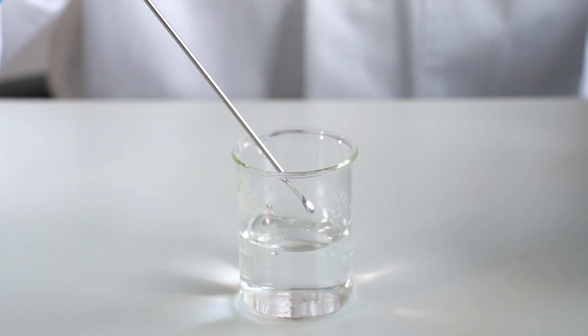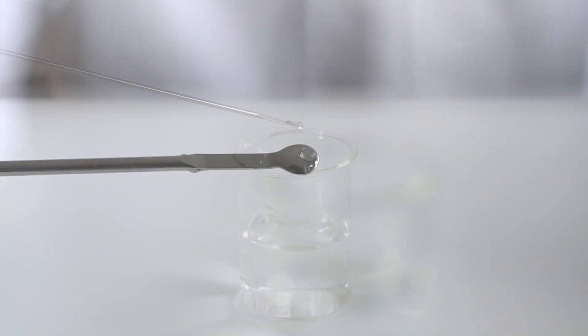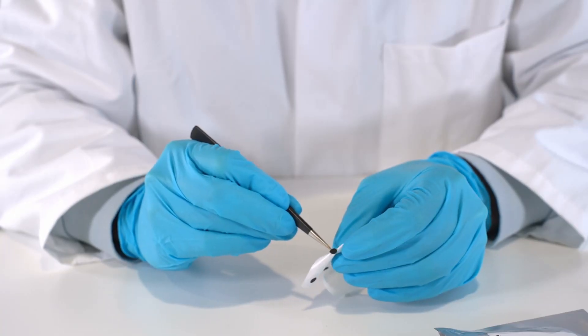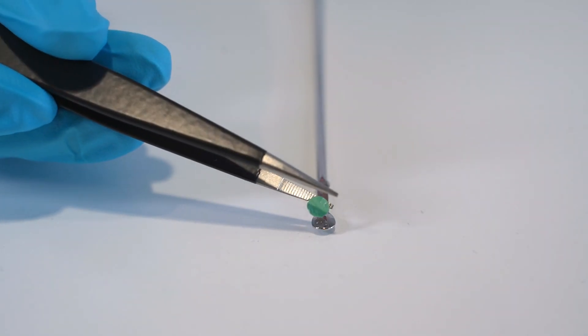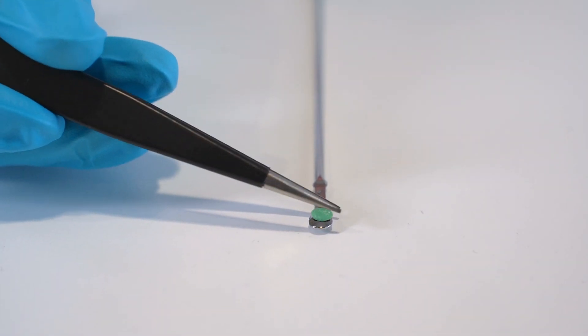Next, dip the spoon of the spatula into distilled water to wet its surface. A small water drop should remain on the back of the spoon. Carefully remove the sensor spot from the package surface and place the sensor spot on the spoon with the water drop with the green and glossy side up.